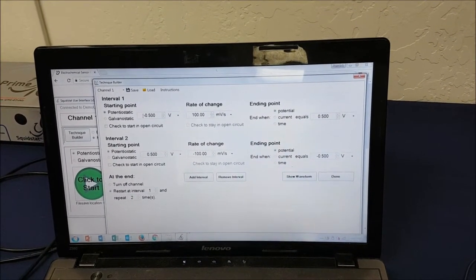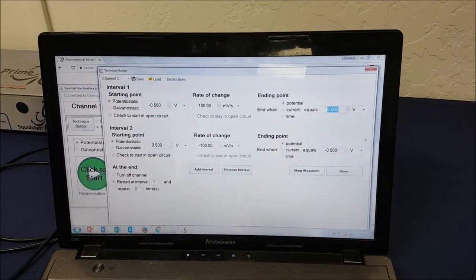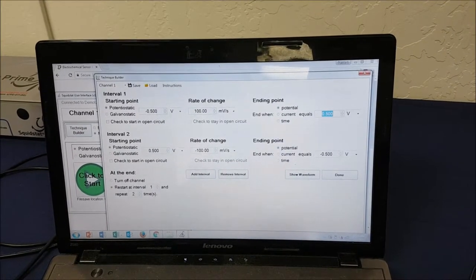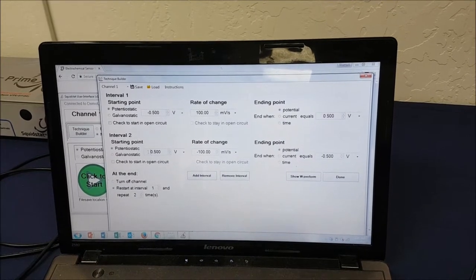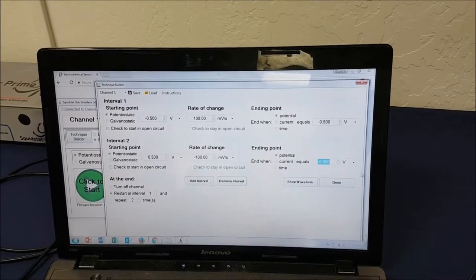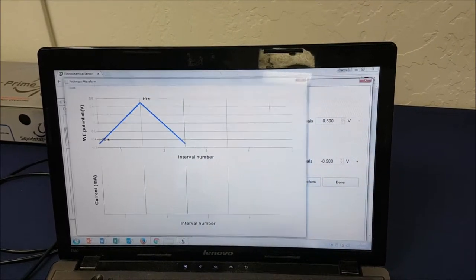I basically want to start off at minus 0.5 volts. I want to ramp up at 100 millivolts per second, and I want to end at 0.5 volts. So I've described here one part of a voltammogram. That's really a linear sweep voltammogram. And then I've got a second interval where I'm going to start at 0.5 volts. I go down at a scan rate, and I finish at, and I'm going to look at the waveform. So it is the waveform for a cyclic voltammogram. So that's a nice quality check.